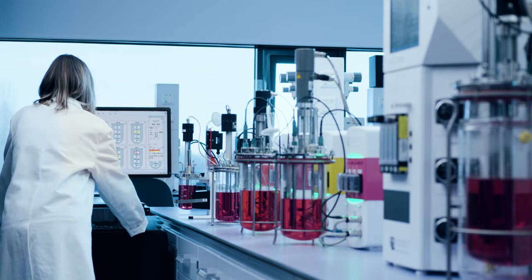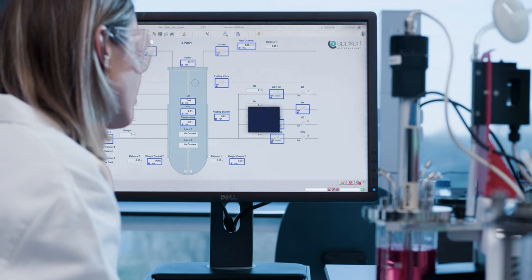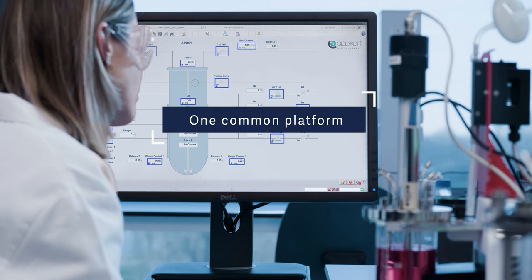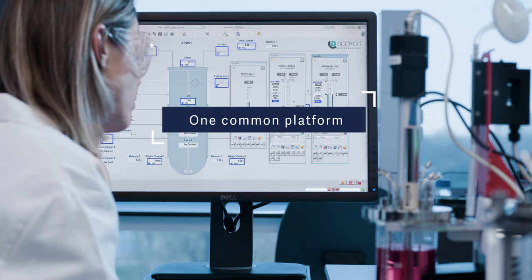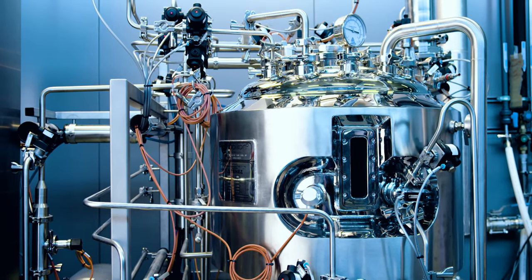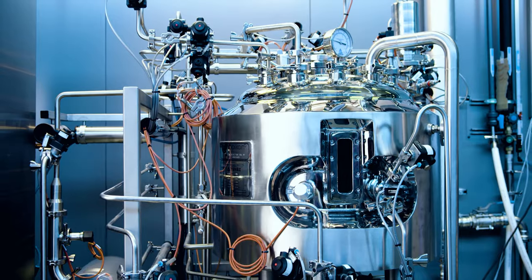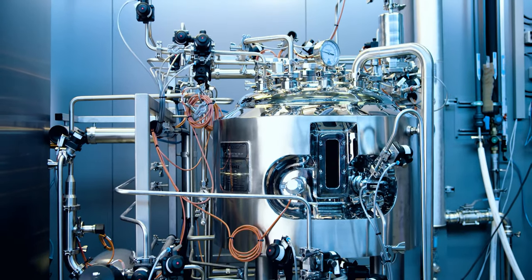V-Control is the ultimate solution for controlling your bioprocess, both in the laboratory and in production.